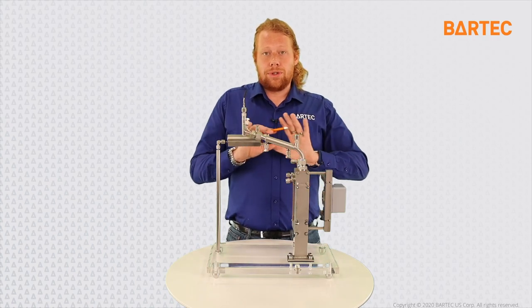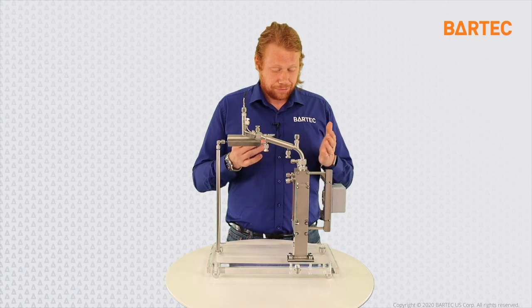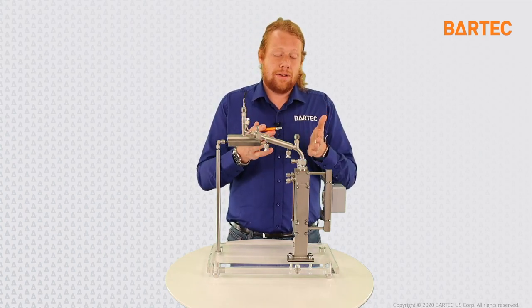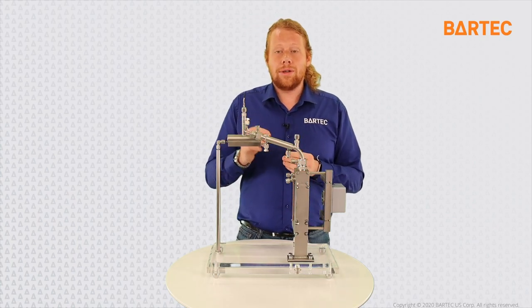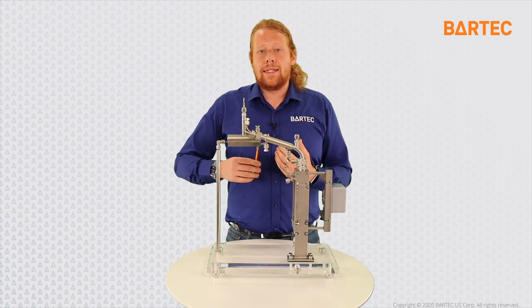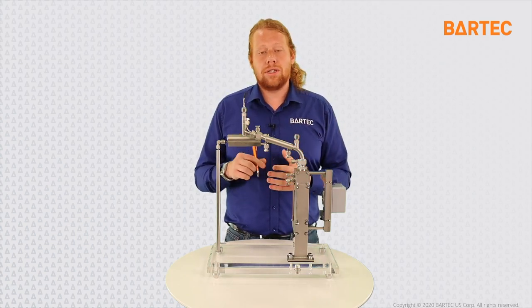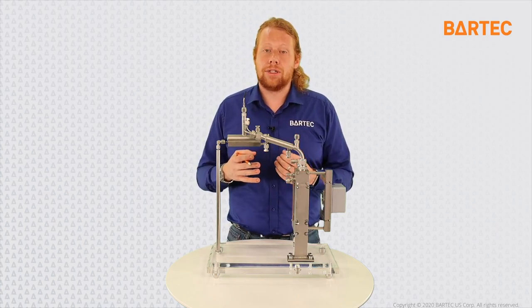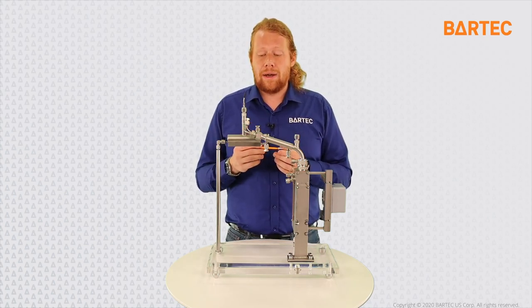With the various components now presented, let's get into a typical flow path. So first, the sample is sent from the dosing unit all the way into the evaporator. Once it arrives in the evaporator, the cartridge heater is turned on. The heating settings, I should say, are adjustable in the software, thus allowing for more sophisticated heating actions or heating cycles to get the sample to evaporate.